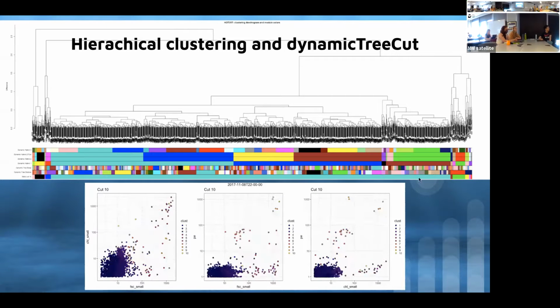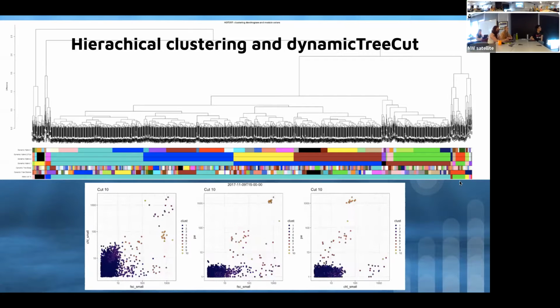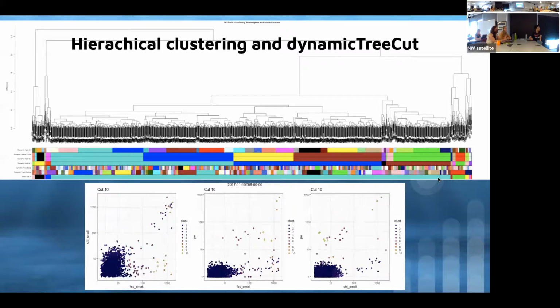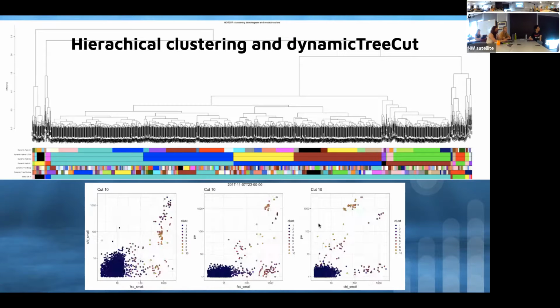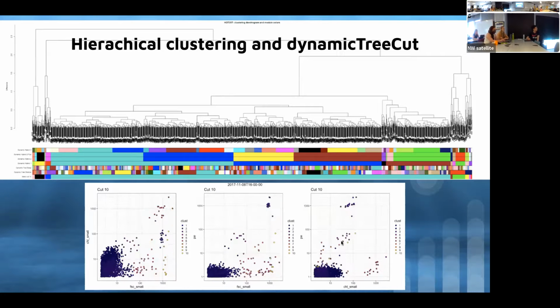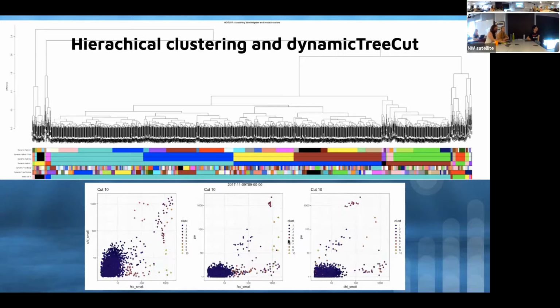And you can see there's a very large blob that is mostly Prochlorococcus with a few other things. And in the end, that's actually the one that worked best, at least for this configuration. The GIF that you see at the bottom shows the identified particles, where it's able to get beads and Crocosphaera, as well as Synechococcus, and the Pro ends up with the noise.